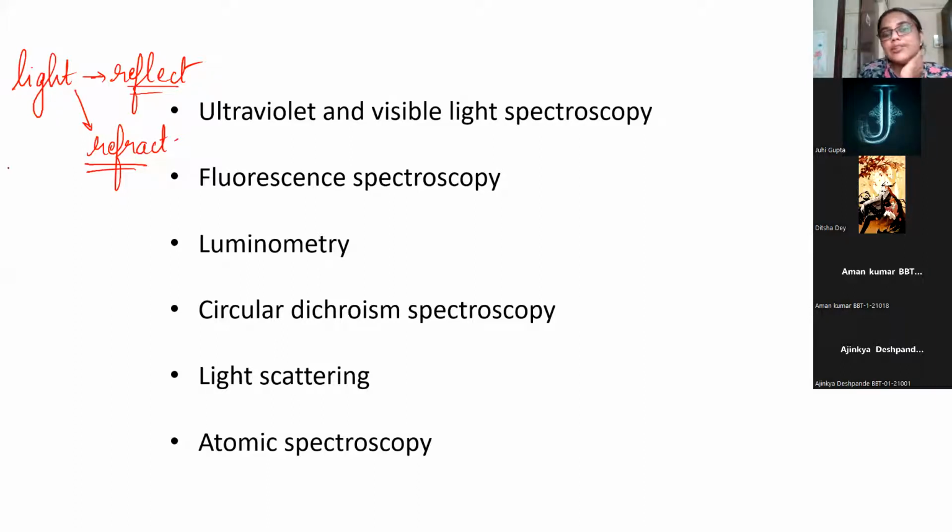We are going to take our sample in a cuvette. Have you all seen cuvettes? Have you all used spectrophotometer in the laboratory? Oh, yes, ma'am. I did this practical. Okay, great. Okay, fine. You all will do it. I mean, you all are doing your BTech, definitely in these 4 years you all are going to definitely use a cuvette.